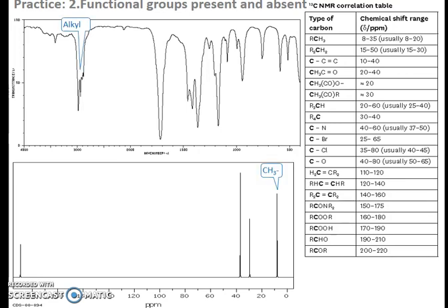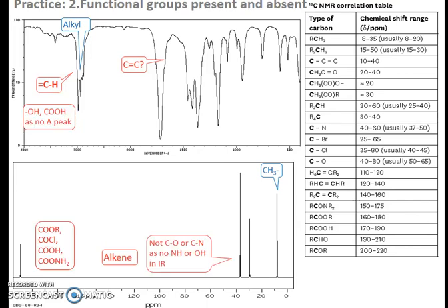Let's have a look. We've definitely got carbon hydrogen stuff. It's definitely not an alkene, because there's nothing in the NMR to indicate that it's an alkene. It's definitely not an alcohol. It's definitely not an ester, an acyl chloride, a carboxylic acid, or an amide.